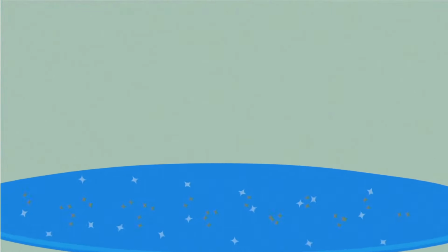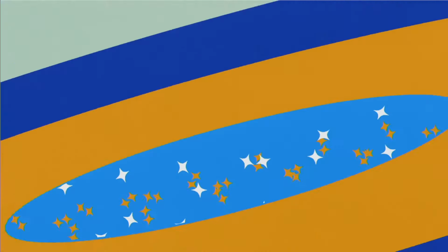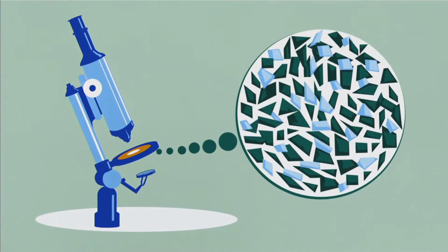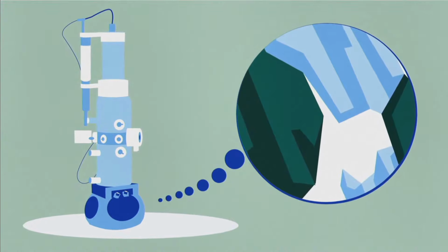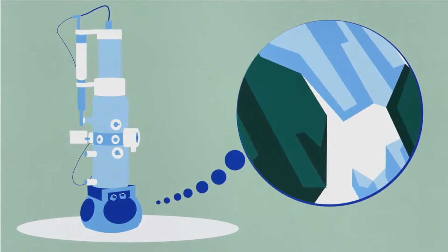Microscopy is a quintessential technique used to understand the microcosm around us. Since the 17th century, microscopes have used visible light to provide a magnified view of miniature objects, enabling scientists to make breakthrough discoveries. A view into the nanoworld became possible in the 1930s, when a team of scientists led by Ernst Ruska invented a microscope using electrons instead of visible light.